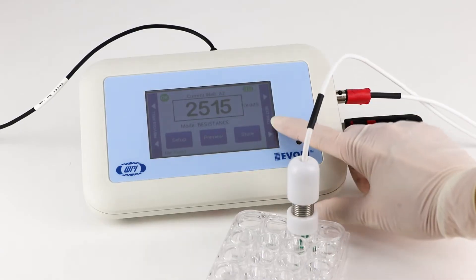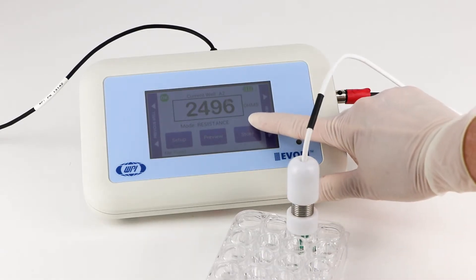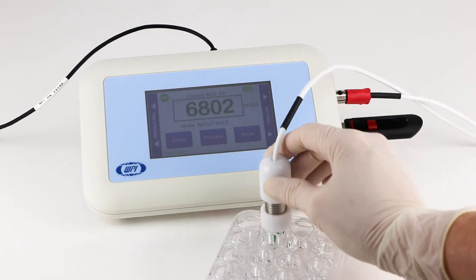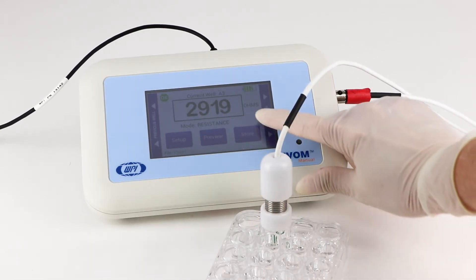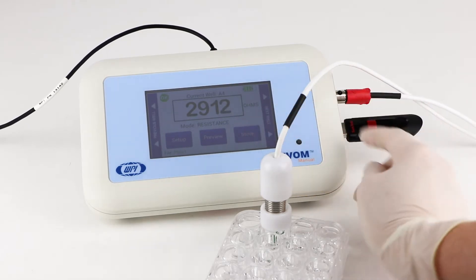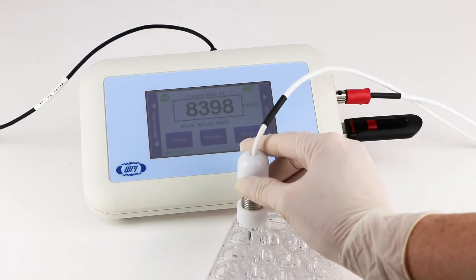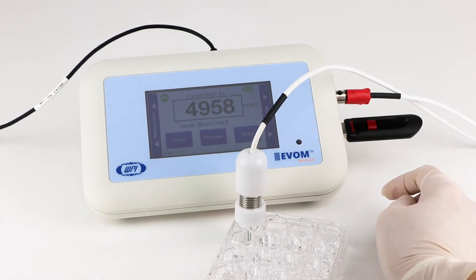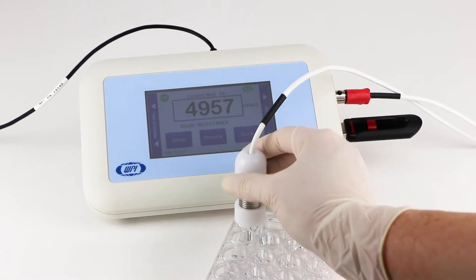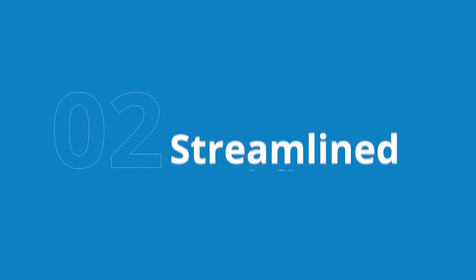First, EVAM Manual eliminates human errors and reduces experimental processing time. The redesign of the electrode ensures consistent placement quickly and easily. The meter reports values faster, so you spend less time waiting for the values to stabilize. This time savings means you can move through a plate much quicker or process it multiple times to track changes during your experiment.